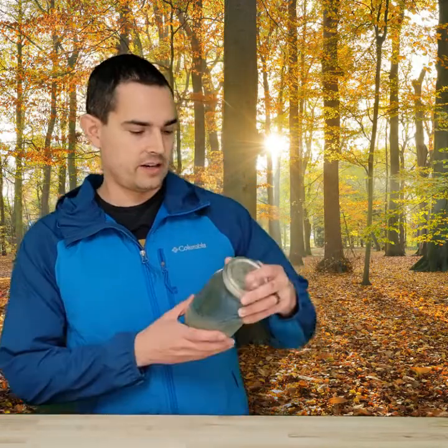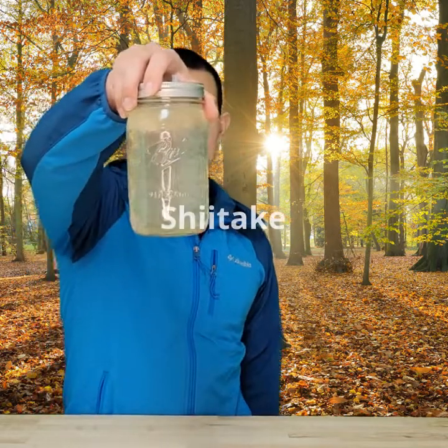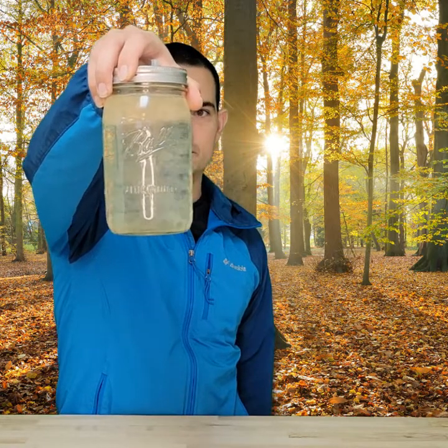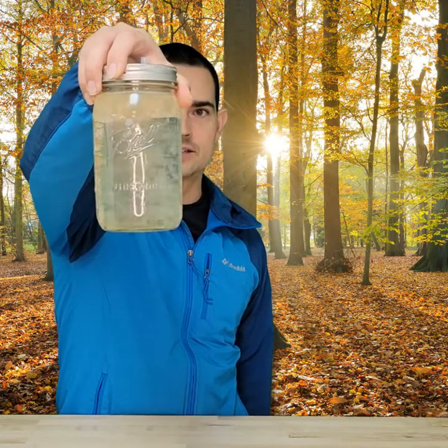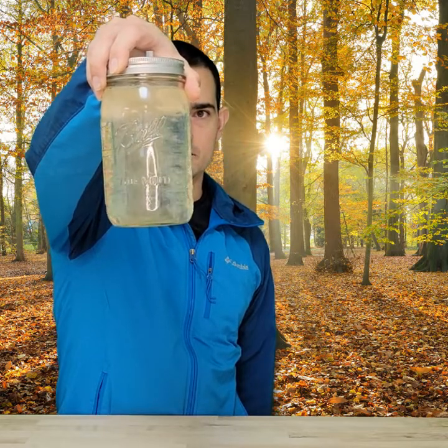All right, let's get started. Today we're going to go right into liquid cultures. Right here we've got an example of a liquid culture — this one in particular is shiitake. As you can see, there's a bunch of mushroom mycelium just floating around in there, twirling around. You can see that aside from the mycelium, it's rather clear.